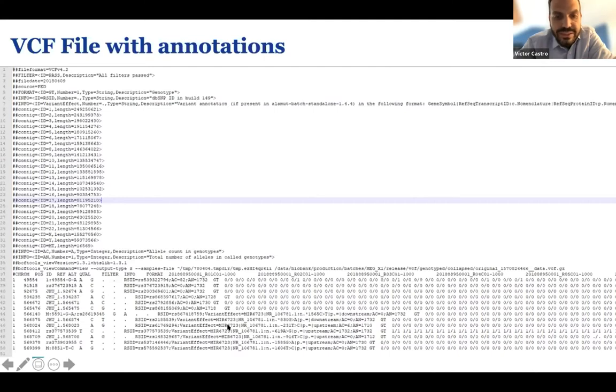The variant effect is actually the gene name, along with information about which protein it alters. There's this upstream, which is the consequence we were looking at, and other information. Then each column after that is a patient, a subject that's been genotyped. And you'll see the 0-0 means homozygous reference. So you see each patient has a zygosity going down the columns.